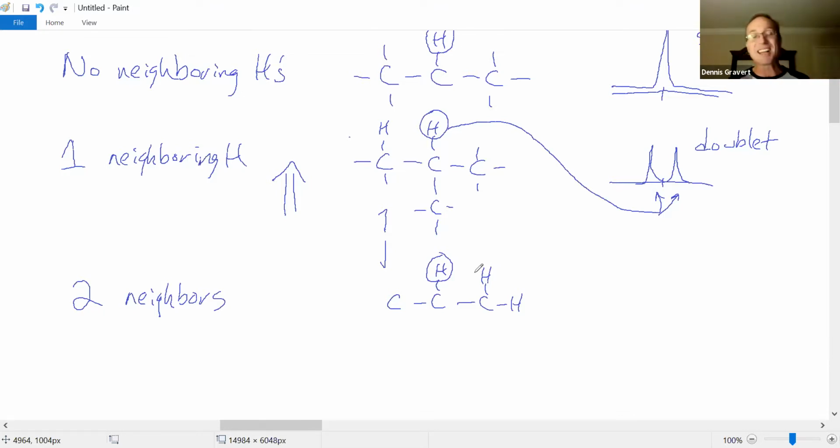So in that whole collection of molecules, one of the molecules might have the two hydrogens both pointing up. And what happens then? Well, the external magnet's pointing up, and these are pointing up. They're going to be farther downfield than this peak, right? So the center line, try to line it up, will be here. And when those two hydrogens, the neighbors, are both up, the peak's going to be farther downfield, like right here. Sometimes, however, one will be up and the other will be down. The first one could be down, and the second one could be up.